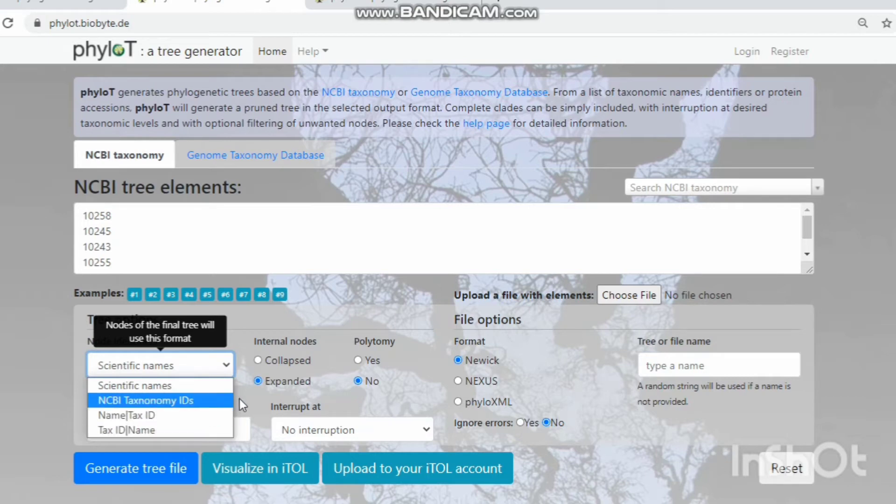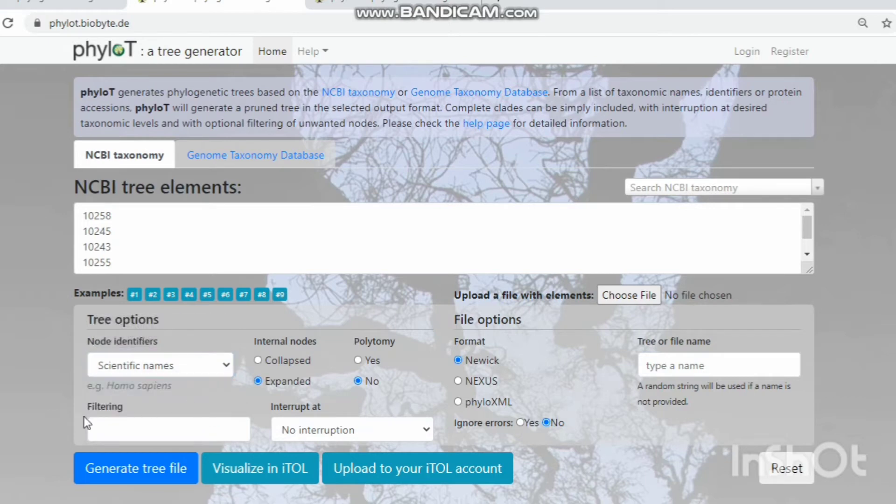The filter option accepts a comma-delimited list of strings. All nodes whose names contain any of those strings will be removed from the phylogenetic tree.